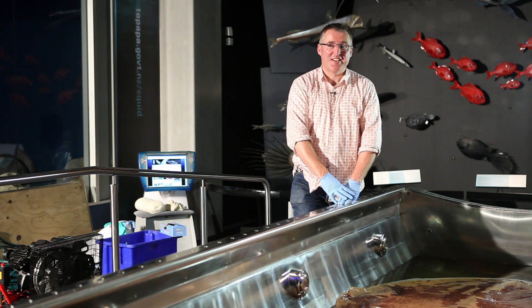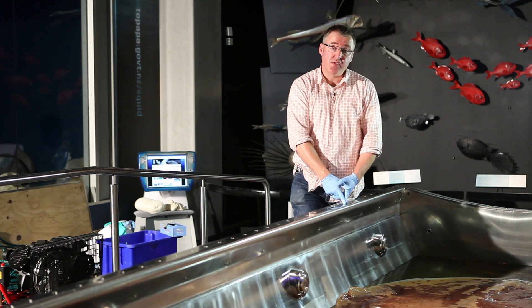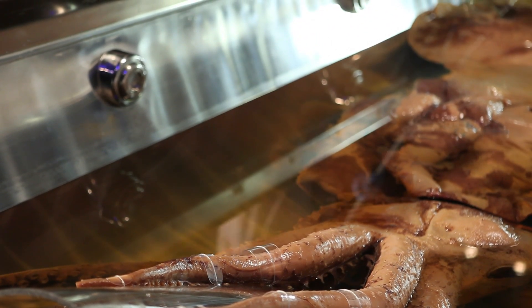Squid gets an oil change. What we're doing today is changing the preservation fluids that the squid has been sitting in for the last year and a half. That entails draining the liquids off, and also cleaning the sediment that's in the bottom of the tank.